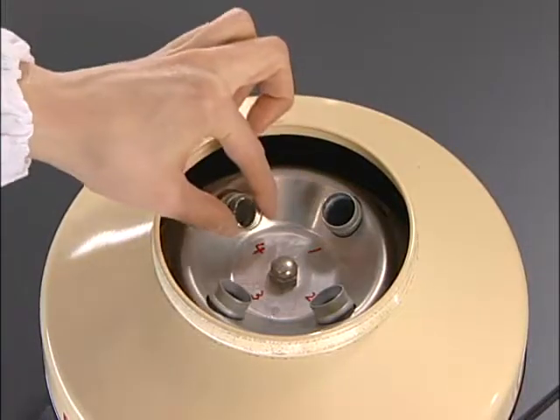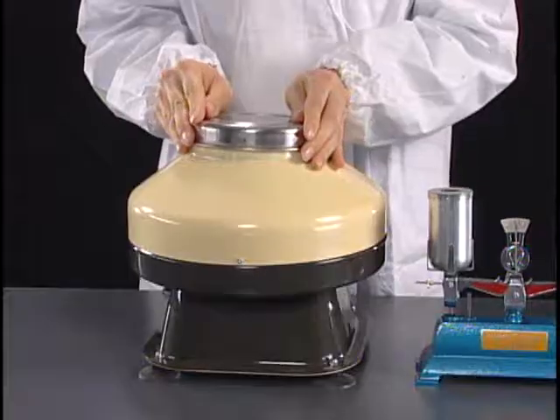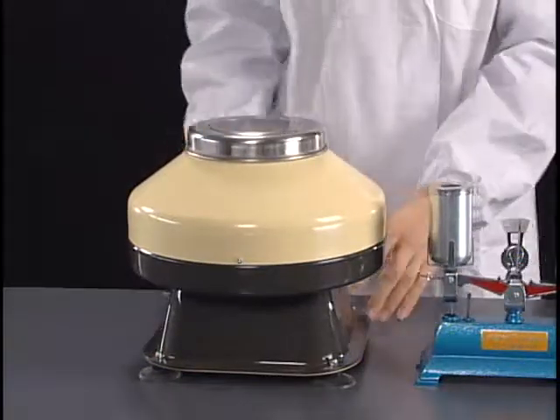Insert the pair of tubes in two holders located at opposite positions in the rotor. Close the cover tightly.